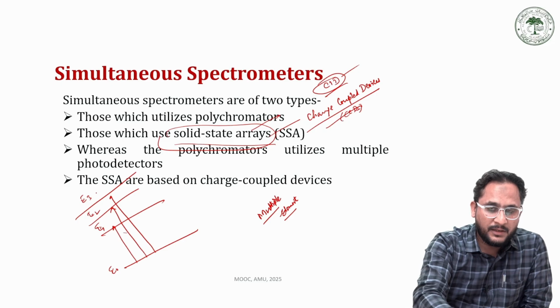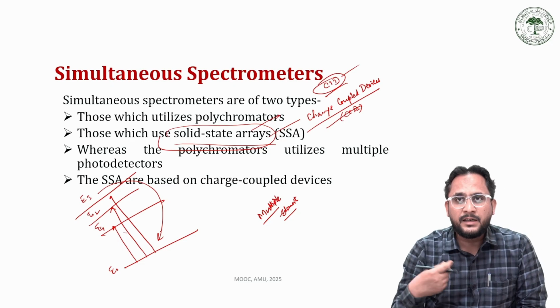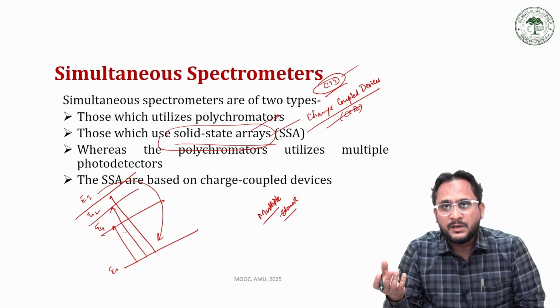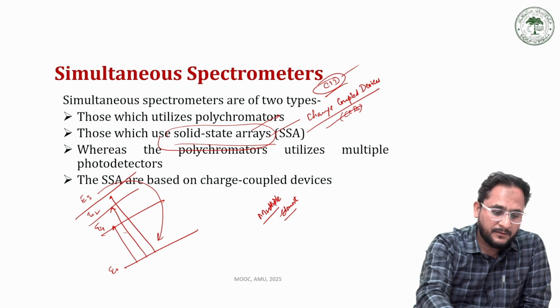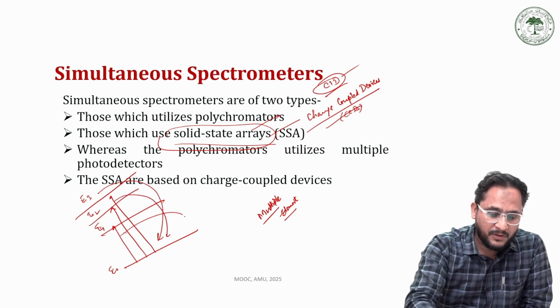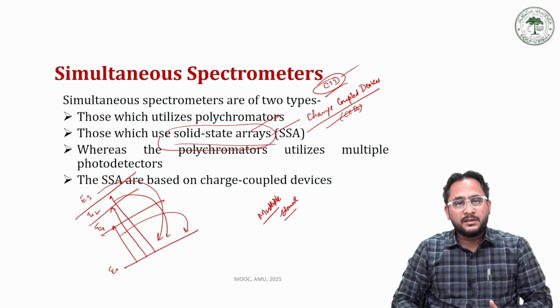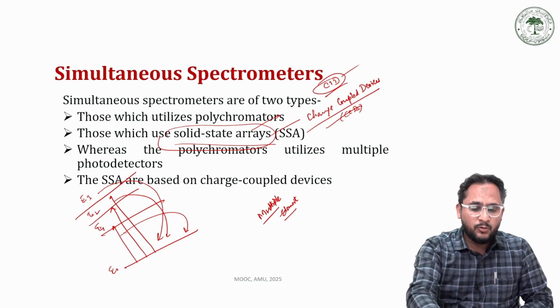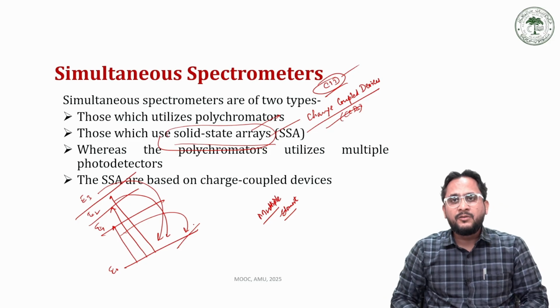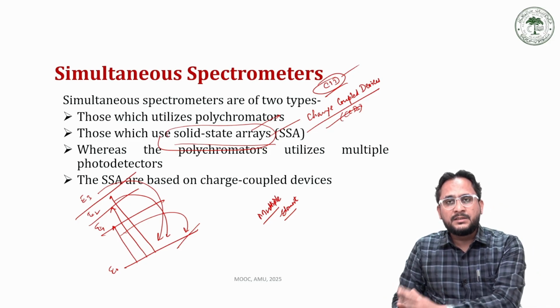So when in AES the electrons come back from E3 to E0, the light radiation emitted, of course, has more energy or shorter wavelength. Then when from E2 it is coming, they have some different wavelength, and when from E1, they have some different wavelength. It is up to us whether we deselect or exclude any of these wavelengths. But if we want, we can have all these wavelengths in the form of spectral lines in the spectrum.